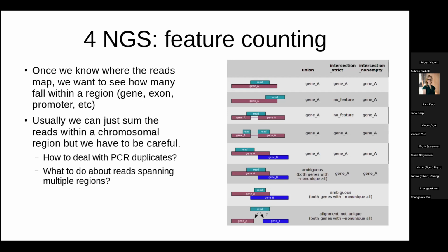So you want to have some software or some routine that accounts for all these things. And usually the big names in the software for feature counting, like for ATACseq and others, they've already considered this. They already thought about this, and they have default settings that generally take the thought out of all the problems that can go wrong with feature counting.